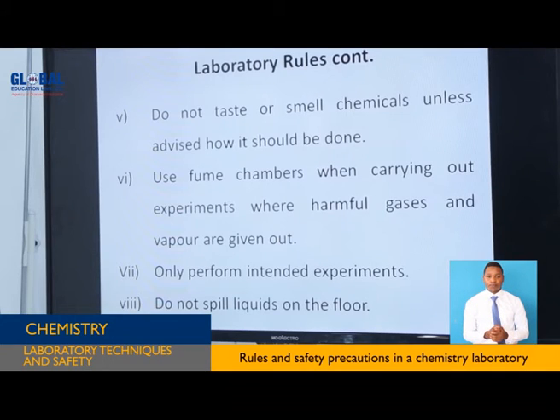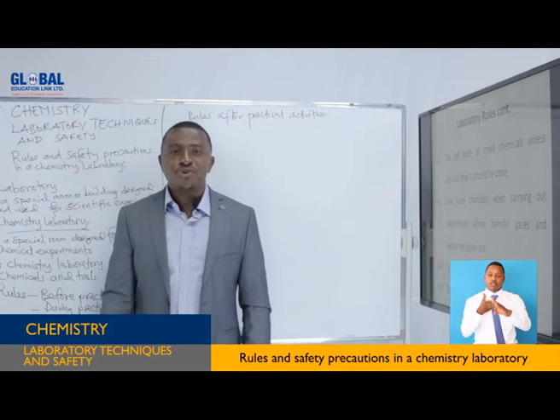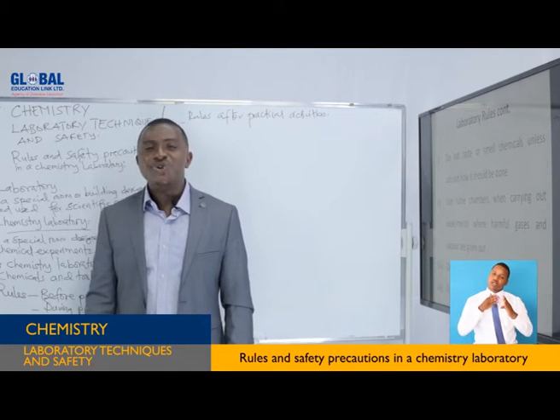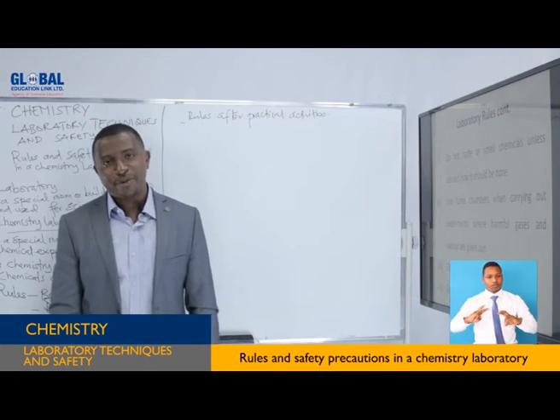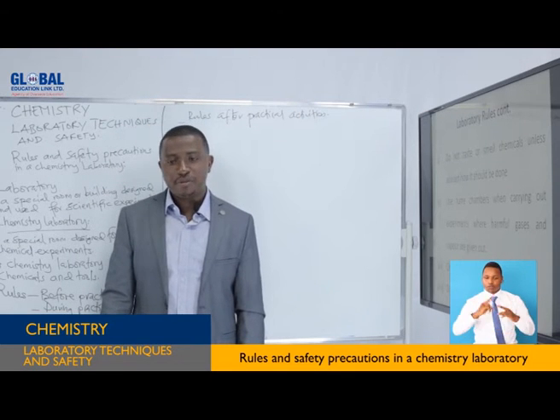Only perform intended experiments. Dear students, if you go in the laboratory, you are required to perform the intended experiments. Don't create your own experiments. Don't start your own experiments. Don't interfere with others' experiments.